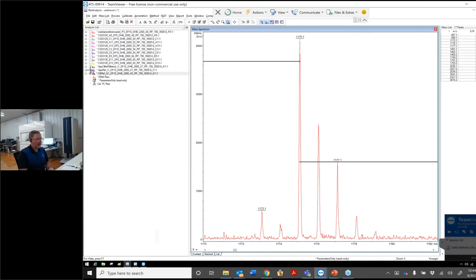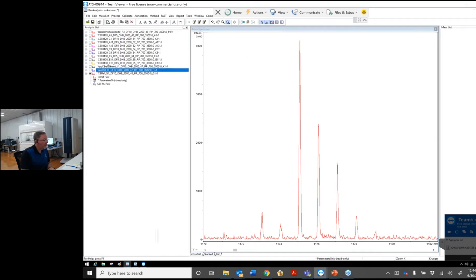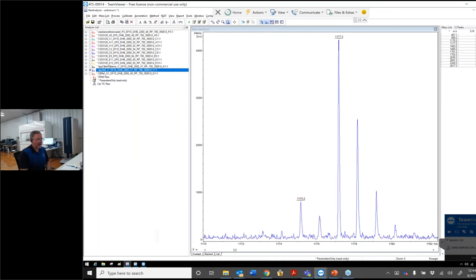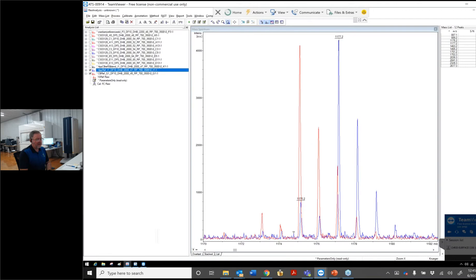Now looking at an apple procyanidin tetramer: the most predominant mass at this degree of polymerization in apple is reflective of an all-B-type linkage. Overlaying these two spectra, you can see a difference in the isotope distribution and overlapping patterns. The blue pattern is indicative of an apple proanthocyanidin, while red is unique to cranberry.